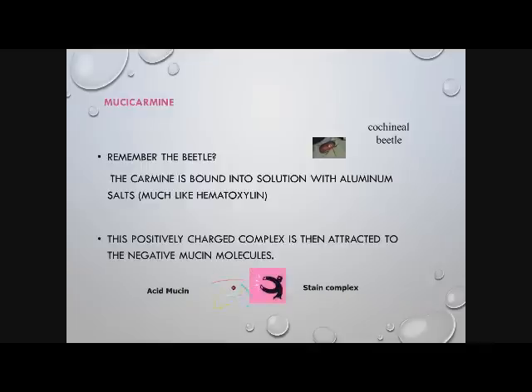So if we think about hematoxylin, and if we look at the logwood tree and we just scrape us some hematoxylin off the logwood tree and we mix it with water, it doesn't do anything as a nuclear stain. But when we add it to a mordant compound, some aluminum salts, it makes a terrific nuclear stain.